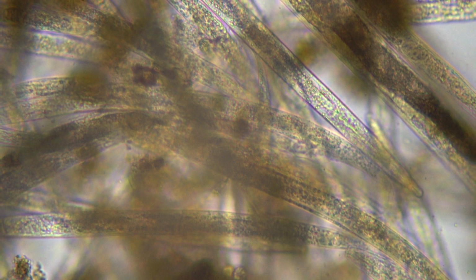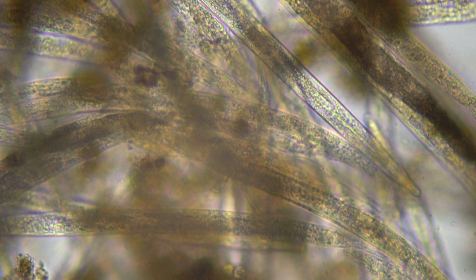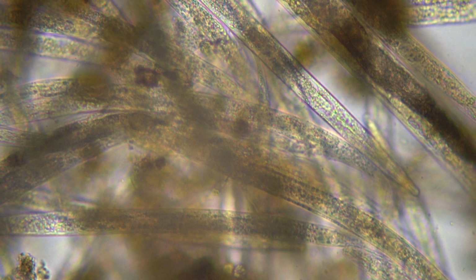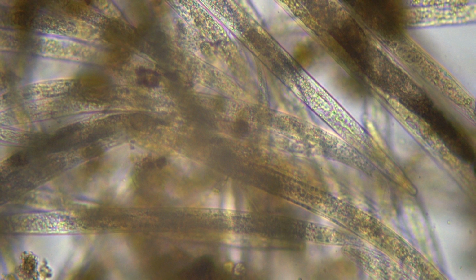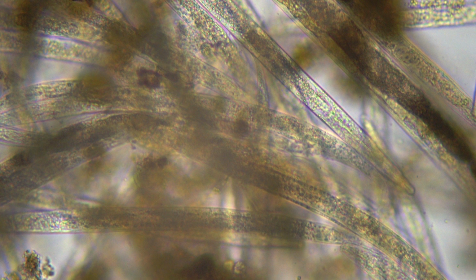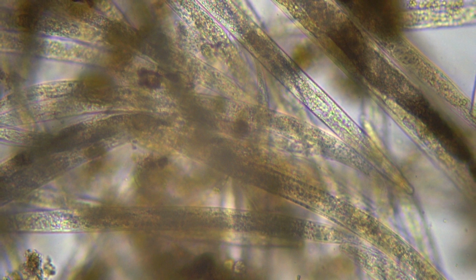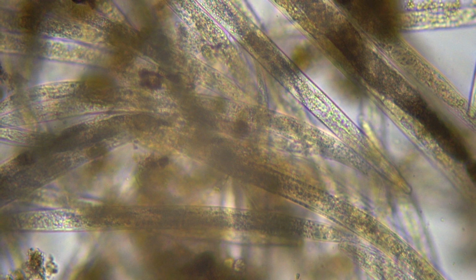These bacterial feeding nematodes will help to cycle more nutrients a lot faster within the soil. So it's more likely than not that these guys will have a beneficial effect for any plants that are grown in this particular compost. But just a great picture.